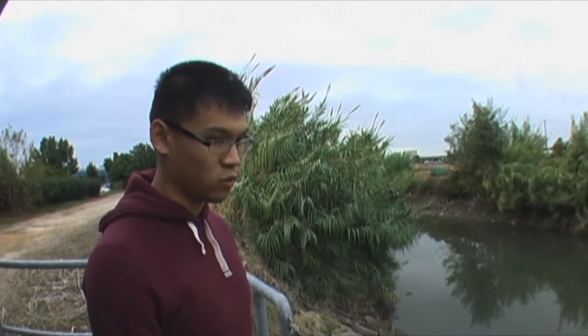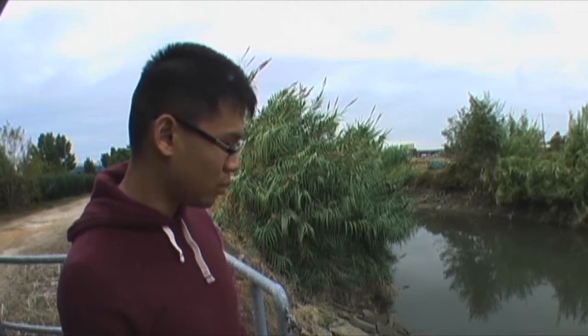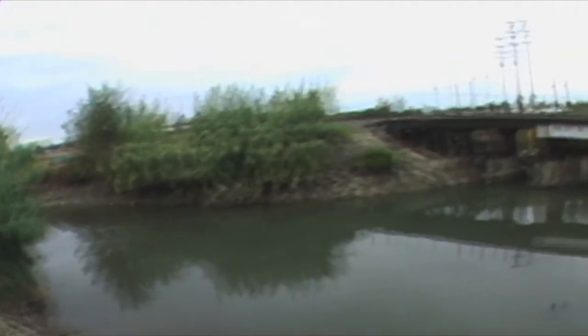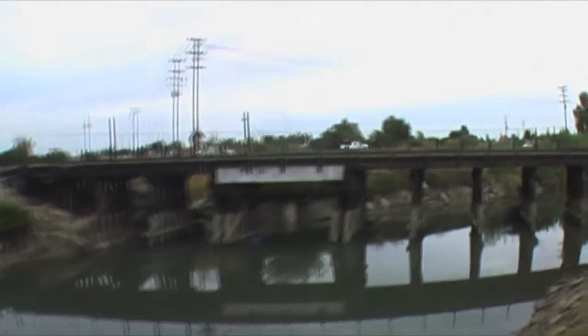So this is our last spot. It looks pretty polluted, so we're hoping for very high levels of nitrate. Probably all the crud that runs off into the city ends up here. We're hoping that there will be high levels of DO due to this larger area of algae biomass. So yeah, we're going to measure it. Alright, let's go.